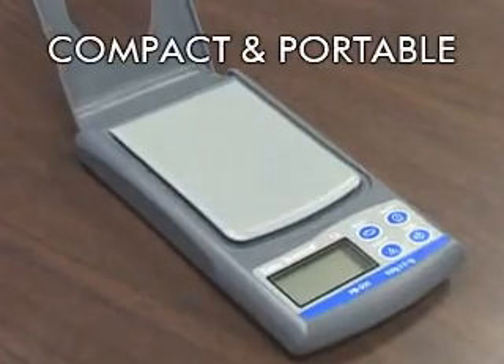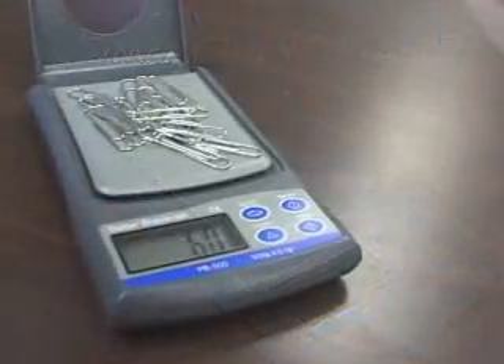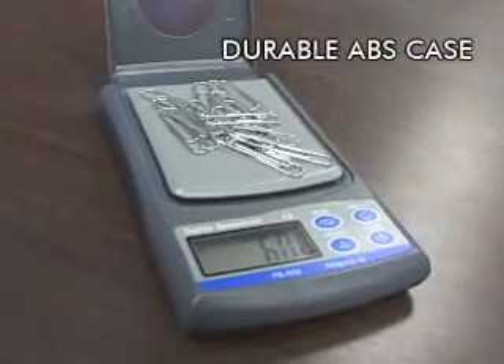Offered in a stylish and durable ABS case with a useful top plate cover that protects the weighing platform from accidental damage while doubling as a draft shield for more accurate weighing.